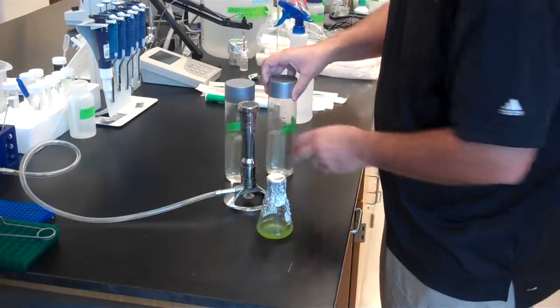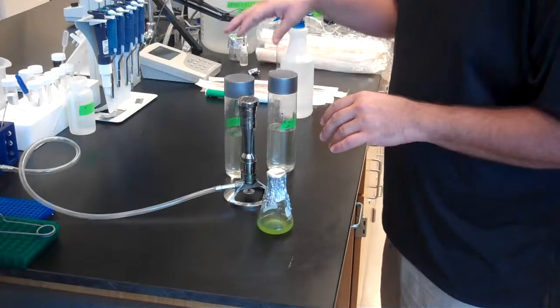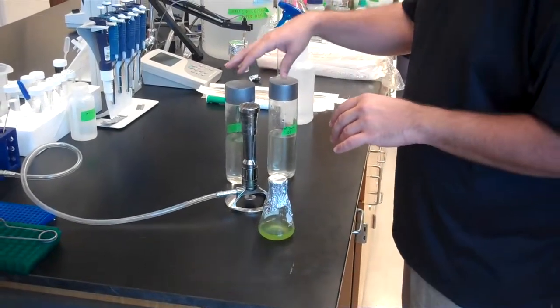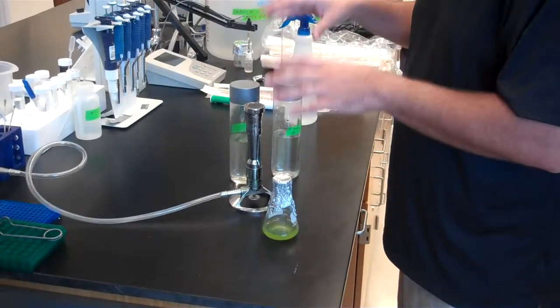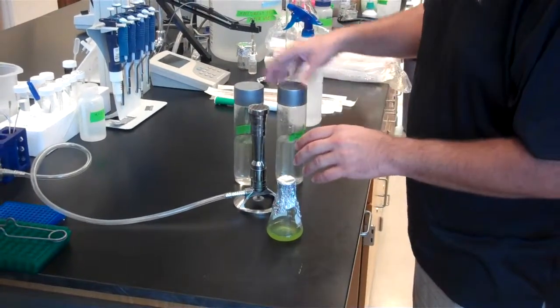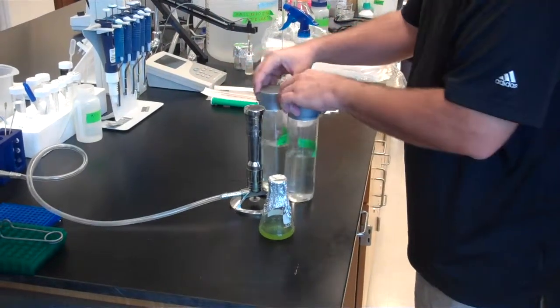So these are my two bottles. This is the high-quality media that was created sterilely. These are two sterilized bottles that are sealed, so that when I bring them into the field and break the seal, they will remain sterile. Got my two bottles up here.